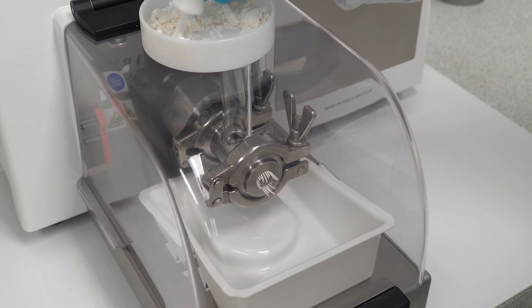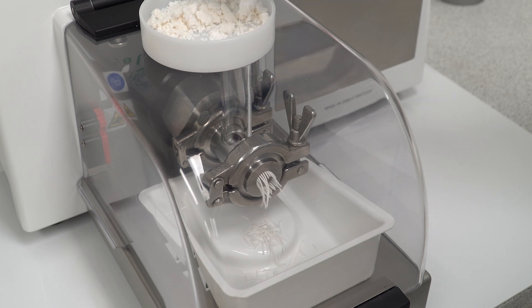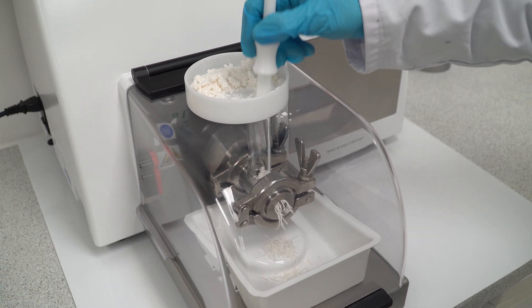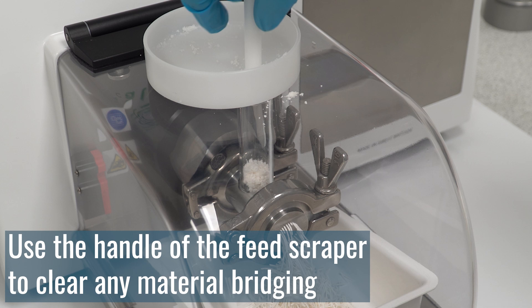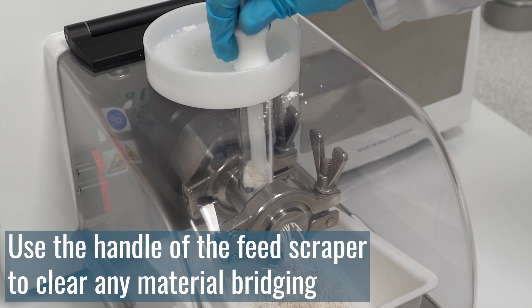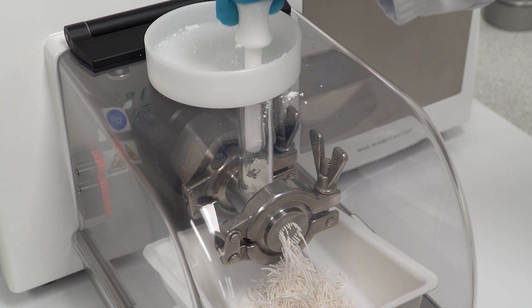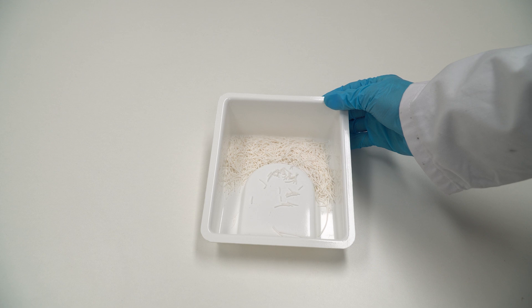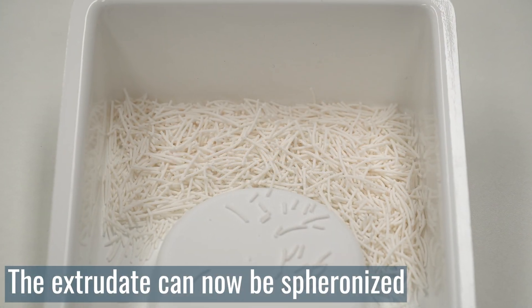The clear safety guard allows for unobstructed viewing of extrudate quality. If material bridging blocks the feed tube, turn the feed scraper over and use the handle to push the remaining material into the extrusion screw. The extrudate is now ready for spheronisation.